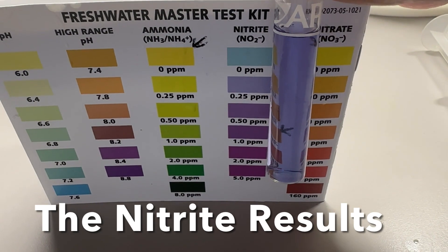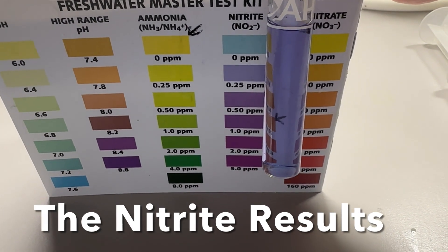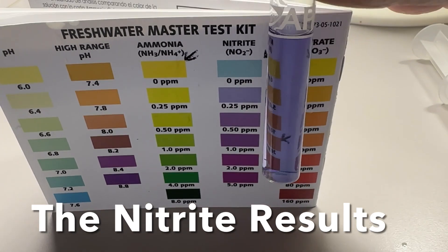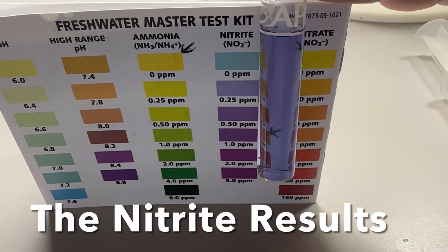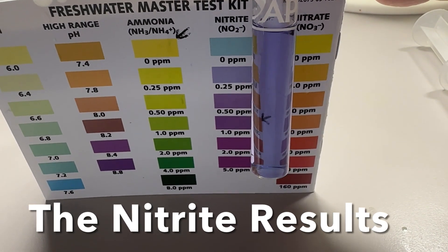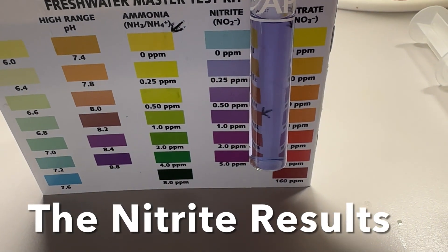On the nitrite test you can clearly see it's at 0.25 parts per million. We're going for zero — that's where the arrow is — and it's a little high but not too high, so you're going to want to adjust and try to bring it down to zero.